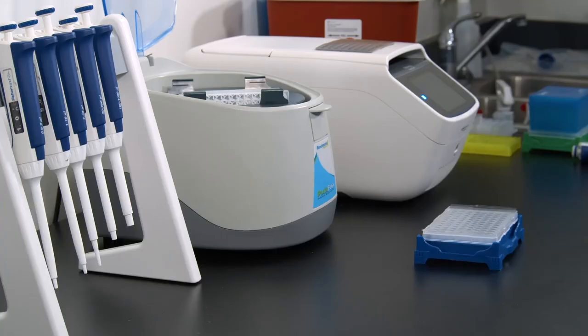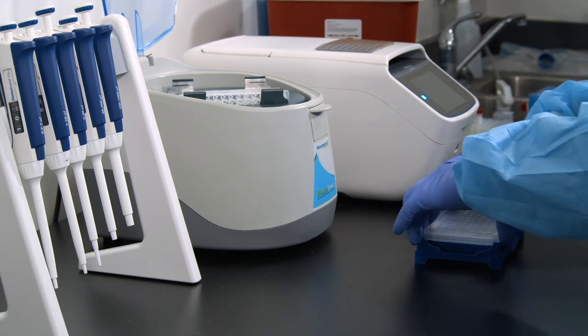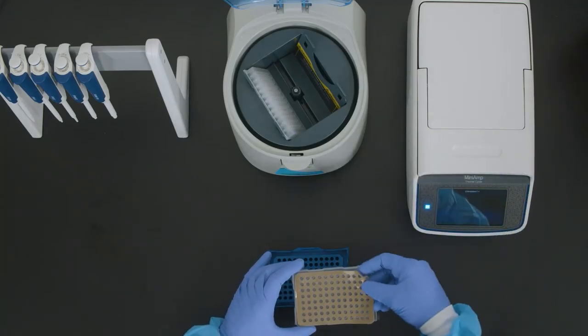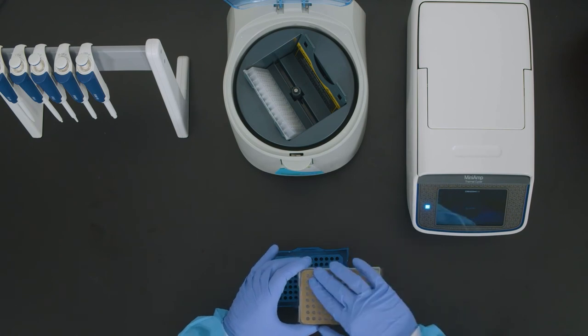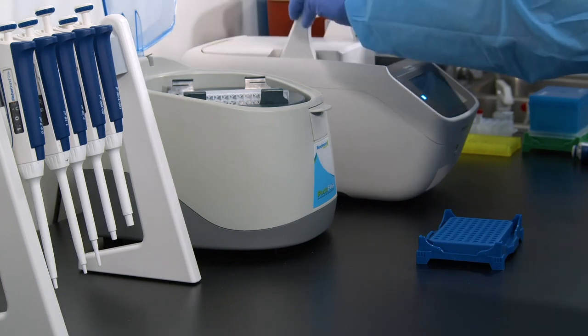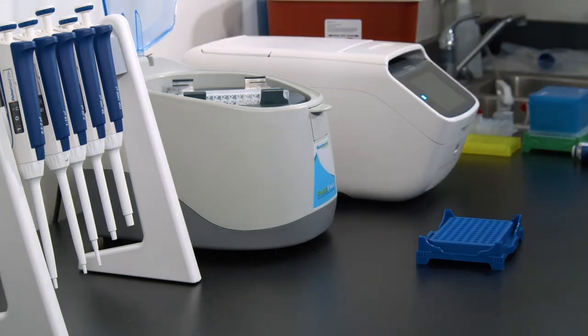In the post-PCR area, place the plate inside the thermal cycler. If a pressure pad is required, ensure it is seated correctly with the gray side down lined up with the wells. Close the lid and select the thermal cycling program. Hit run.